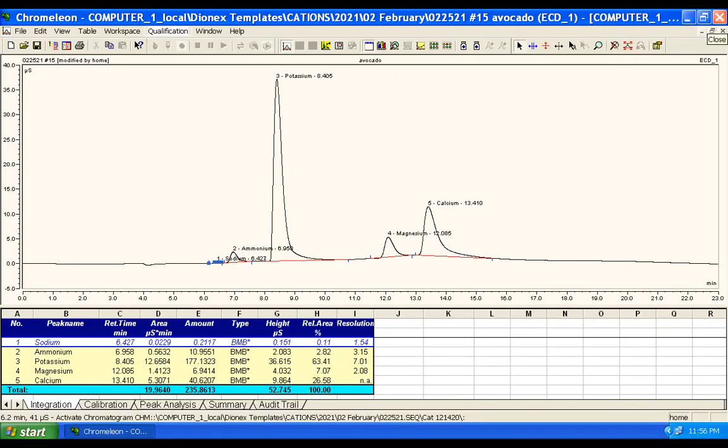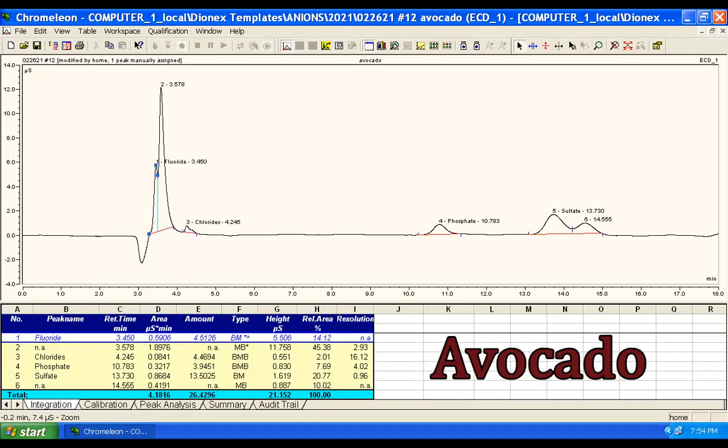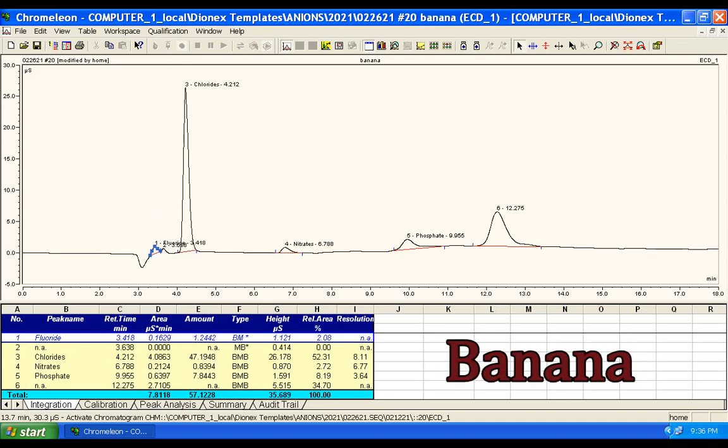Here's the cation makeup of avocado. Compare this with the notorious potassium-rich banana, which actually has more magnesium — so if you're magnesium deficient, take note. On the anion side, the column is not designed to pick up organic salts like oxalate, acetate, formate, etc., so some peaks are not identified. But we can still assess chloride, phosphate, sulfate, and in the case of the banana, a bit of nitrate.